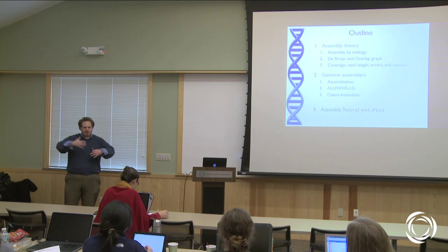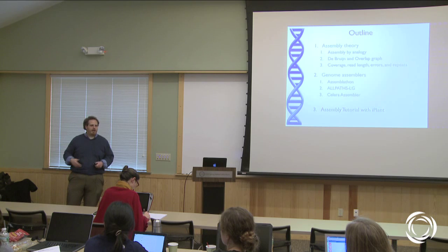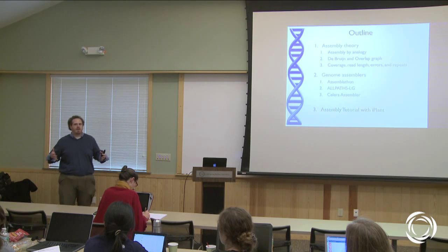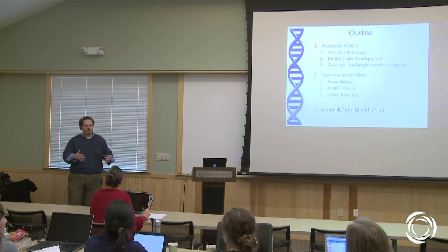But then we're doing this little assembly of it, where we take multiple of these short reads and do a pre-assembly of that, which has a tendency to virtually cancel out all the errors of the data. So from the data I've seen, the reads are a few thousand base pairs. They're basically error-free after this process. That has really nice advantages, not only for assembly, but for haplotype phasing and other things.